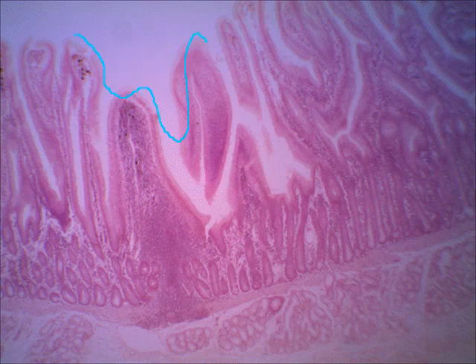See how it's real bumpy looking? It goes down and up, and you see parts of the mucosa jutting out. See how that juts out? How this juts out? Let me erase some of these. Do you see how this juts out? In your lecture, you learned that these finger-like projections, which here you see it in pieces. It's got to be sectioned just right to show that. But those are called the villi, and they extend out into the lumen. The lumen is this area. That's the opening inside the organ where the food is.